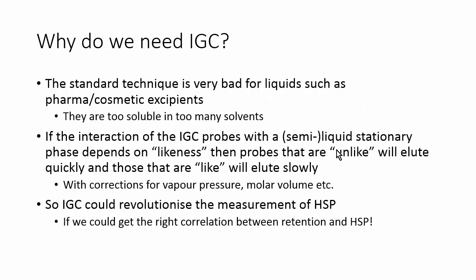That brings us to IGC. The standard technique is very bad for liquids, such as pharma and cosmetic excipients or oligomers of polymers. They're too soluble in too many solvents. So if you try your 20 test tubes, 18 of them you'll find are soluble or miscible.